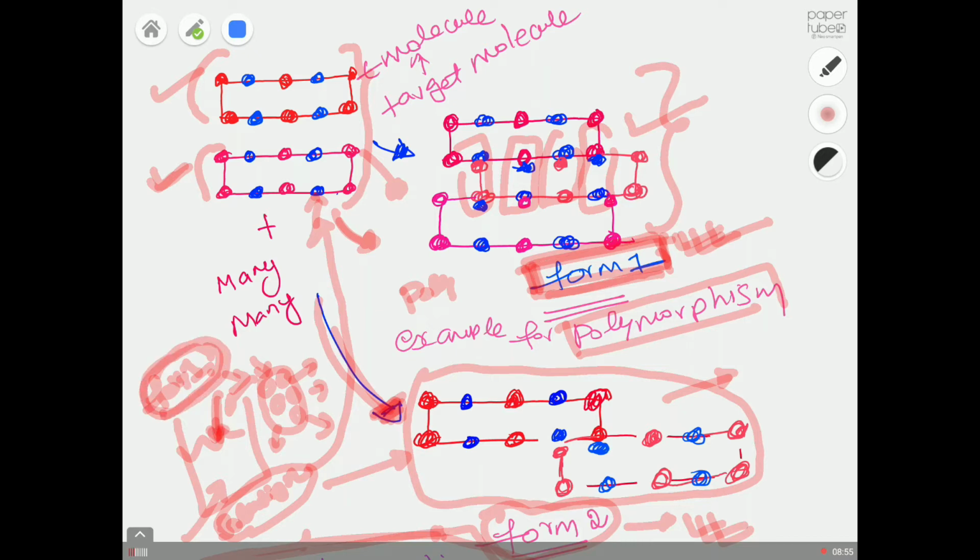So at the end of your experiment, you will just get form 1, as bigger sized form 1 crystals. This is one way to get only one form of your target compound. This way, first you control the crystal size distribution, and second you also control the form of your final crystals, which means you dictate the crystal structure.